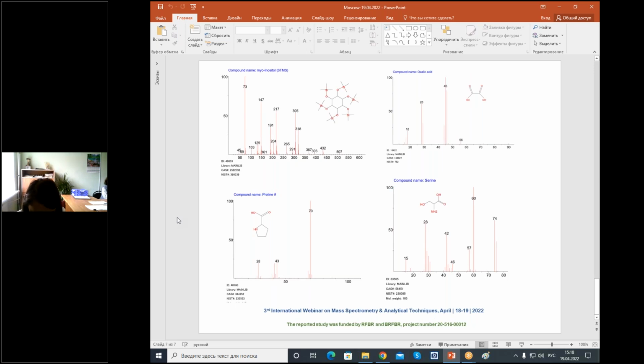Conclusions. Our results are consistent with earlier findings that the accumulation of proline and other amino acids increases with water potential decrease in the leaves.